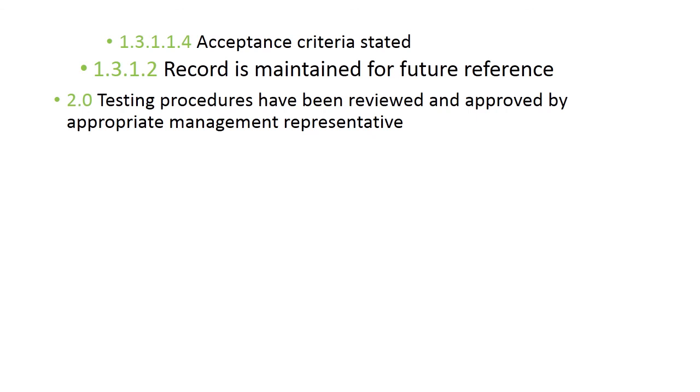Record is maintained for future reference. For all the above activities we have to maintain proper records, and store those records properly for future reference. And the final point says that testing procedures have been reviewed and approved by appropriate management representatives. So again, the laboratory management representative plays a very important role in approving this entire exercise, that is, testing of LIMS software. So go through this slide and let me know if you have any query.